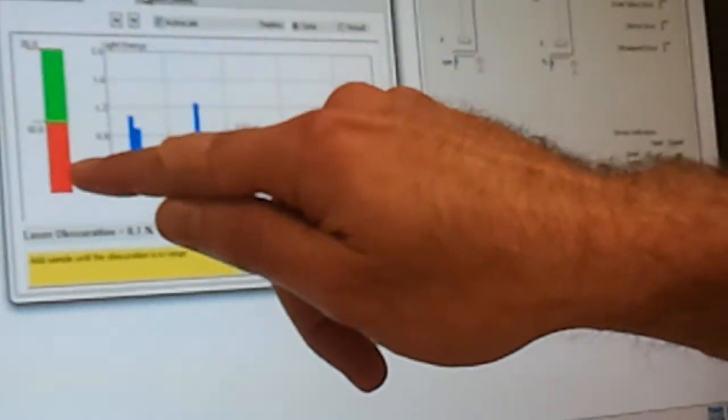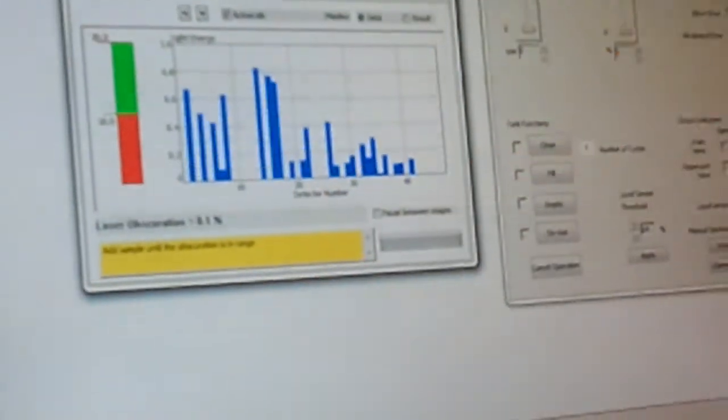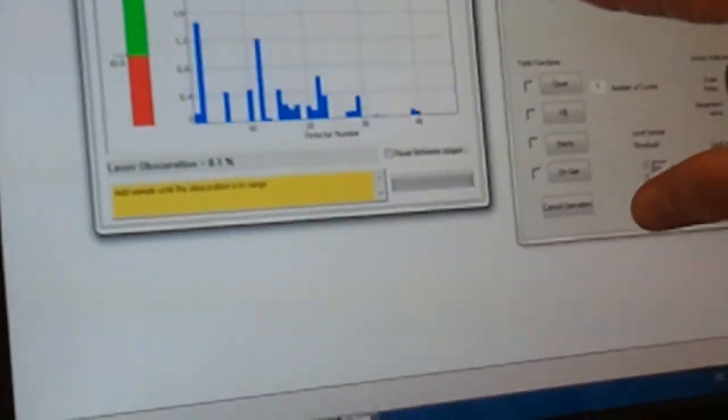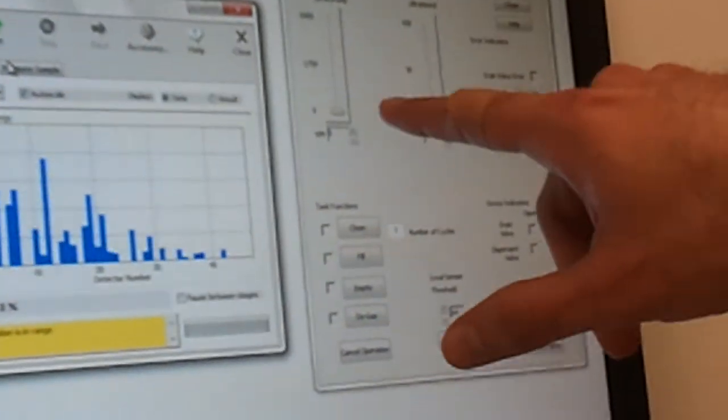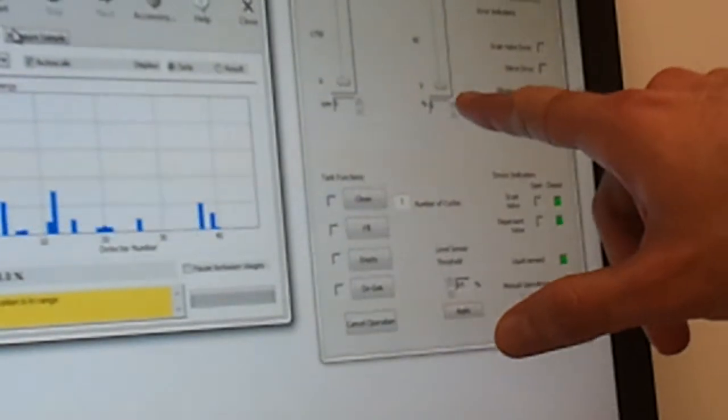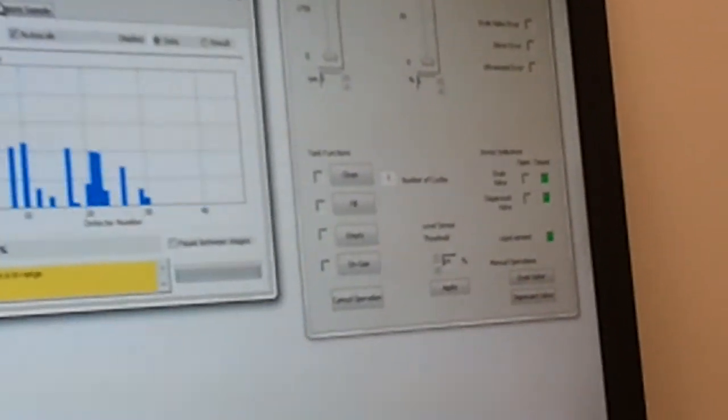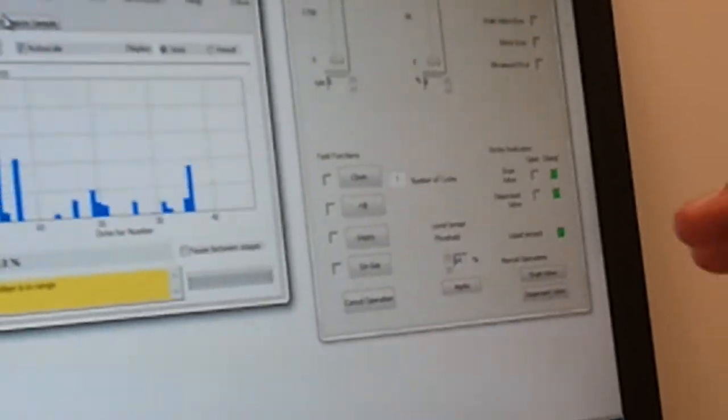The level here will be increasing, increasing, increasing. At that time you need to have this and the stirrer and the ultrasound running at a level that you're comfortable with for your sample.